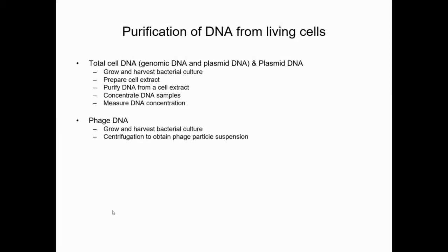To prepare the DNA, if you use an E. coli based vector, then you transform the plasmid DNA into the bacteria. If you use a phage vector, then you transform it into the phage. Then you have different procedures to purify the DNA.